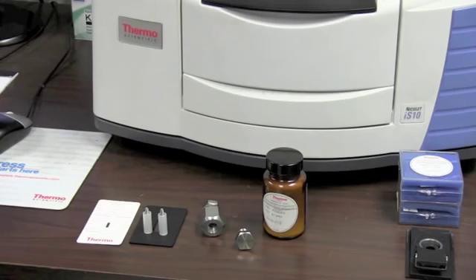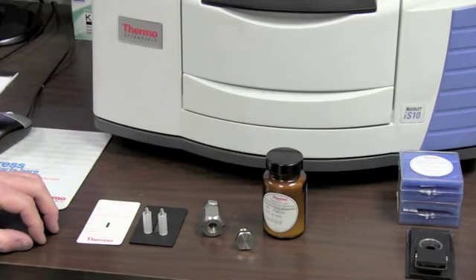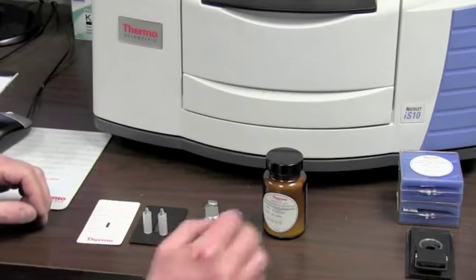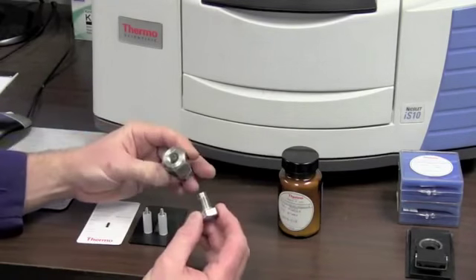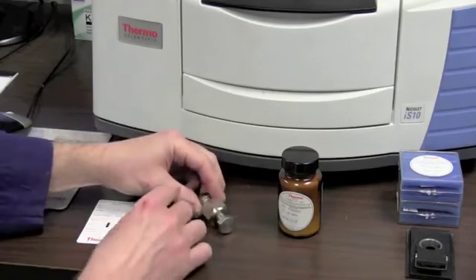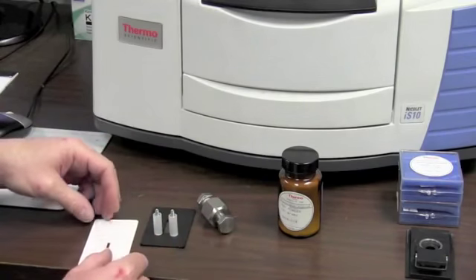FTIR analysis is handy to use for several different types of samples. We can have powdered samples, we can have solid samples, we can have thin film samples, and we can have liquid samples. There are several different ways to get the sample into the FTIR. One is using a potassium bromide along with a powdered sample. Screw it together and press it into a pellet, and then we put that pellet on the rack that will go into the light path, and we shine the light directly through there.